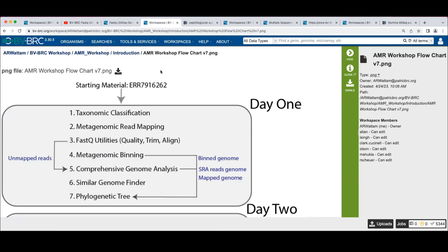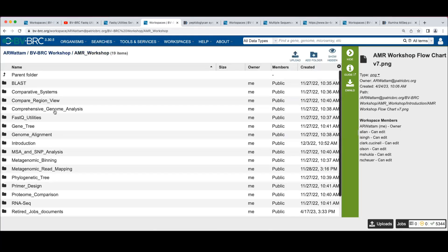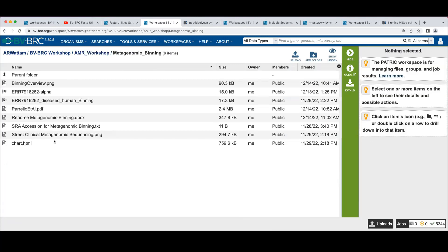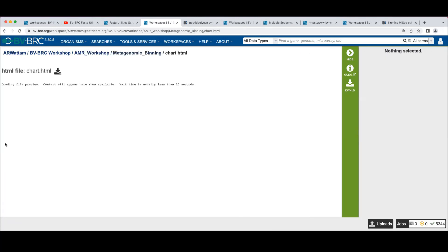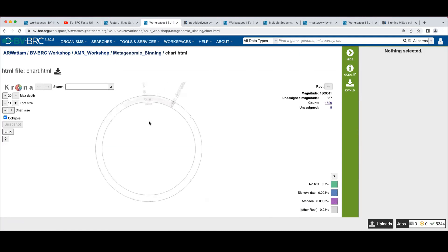So remember when we looked at the classification, the work we're going to be doing is in this metagenomic binning folder in the workspace. So we've got a copy of this chart.